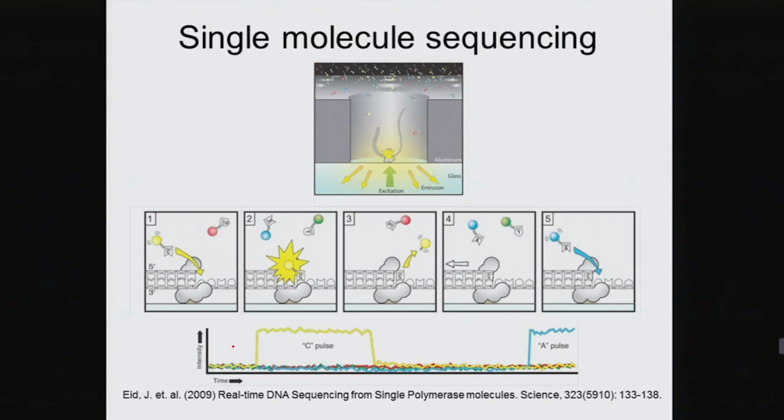In this type of sequencing, your nucleotides have a fluorescent tag attached to them. So if we incorporate the correct nucleotide, we get a burst or a pulse of that fluorescence, which is then detected on the machine, on the screen, and it's emitted as this intensity reading, okay? And depending on what color you attach to which nucleotide, you will be able to determine what nucleotide was incorporated. And again, if a nucleotide is incorporated, that fluorescence gets cleaved off.